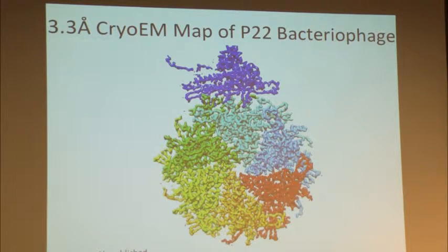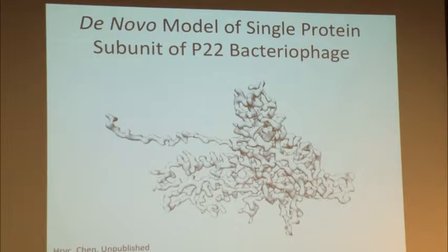So this is our density. Now, from this density, the biologist, just like the crystallographer, is interested to see where is one end of the molecule, they call the N-termini, to the other end, they call the C-termini of the molecule. So that is our next step, called model building. Here I'm showing you one of the 7 polypeptides that we have.